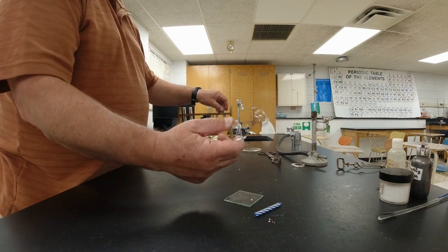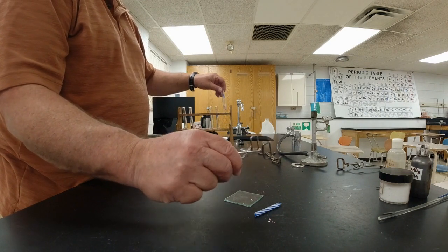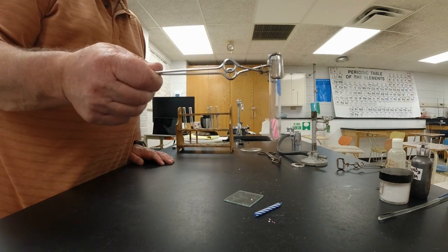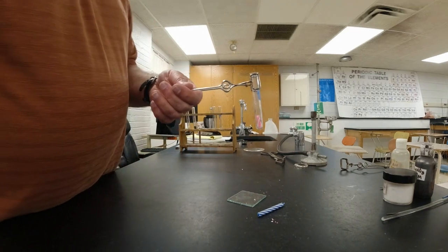All right, this is a test tube holder. If I squeeze it, it lets go. If I relax it, the spring makes it hold on to a test tube. So this is the test tube. This is how you grip a test tube with this if you're going to heat it. All right, so let's make sure you guys can see what's going on here.